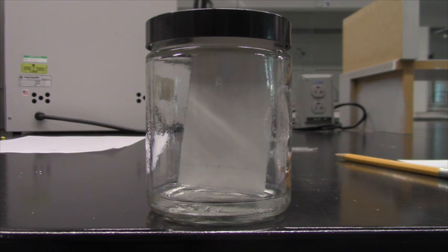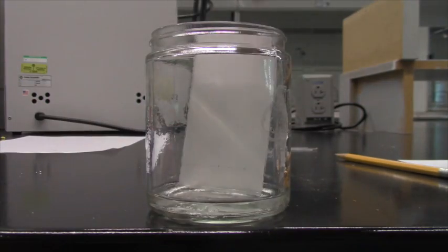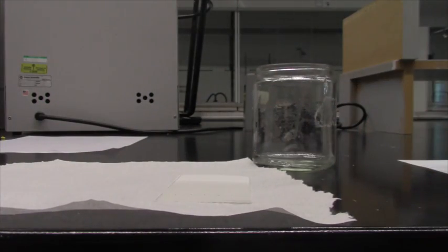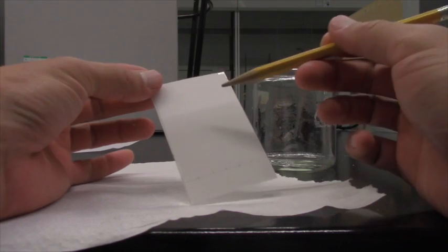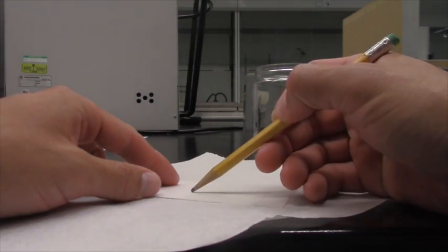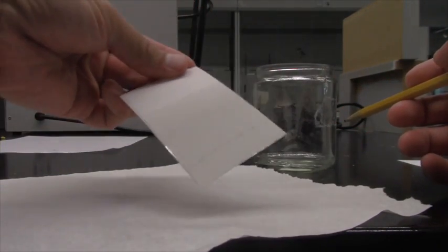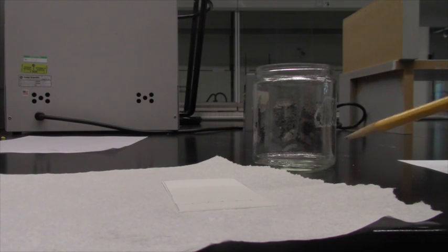Once your TLC plate is done developing, you'll take it out of the jar and go ahead and just throw it down onto a paper towel. Now, right away, what you want to do is mark with a pencil the level that the solvent reached. So just draw a line right across where that solvent front stopped, and that's going to be useful later on when we calculate our RF values for our different compounds. So easy thing to forget, just make sure you do that right away, and then you can go ahead and let it sit and dry for a few minutes.